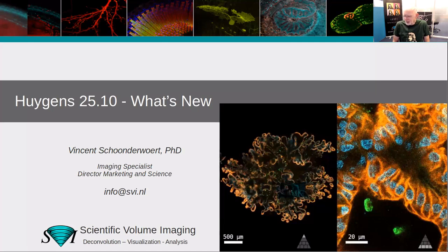I'd like to start this webinar about Huygens 2510, about what's new in the release that we released 2 weeks ago, I think. I hope you can all hear me and see my screen. So let's start. There are quite a lot of new things, so the developers in our team worked really hard. You will be the witness of that very soon.